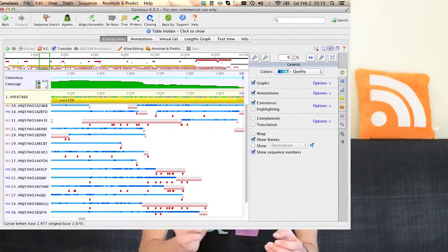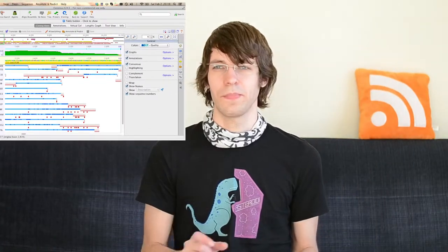The draft mitochondrial genome for Dinocras is the consensus you see on top, and we export this one and BLAST it again against the database. This time we hope to find some more reads, because the Dinocras draft genome is much more similar to the actual reads than the Pteronarcys genome. We are able to increase the coverage by around 10%.